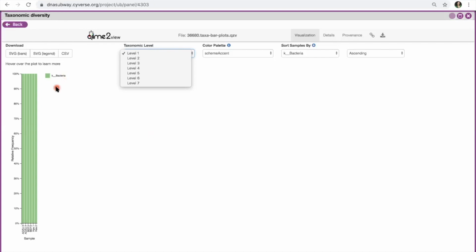And that's also fine. Sometimes that happens because we're dealing with beetles, which are eukaryotes. They also might have some bean matter still in their guts. So when you extracted DNA, you might have also extracted some bean DNA as well. And so it's okay if you also see eukarya here. And in future steps outside of DNA Subway, you're going to be filtering all of that out anyway. So it's fine if you see all three domains there.